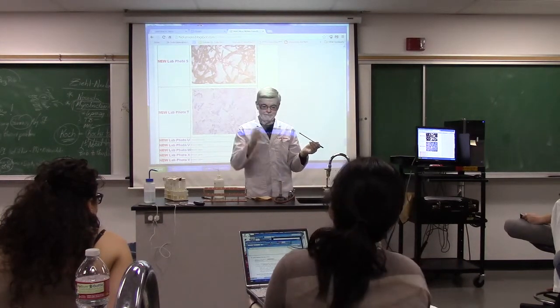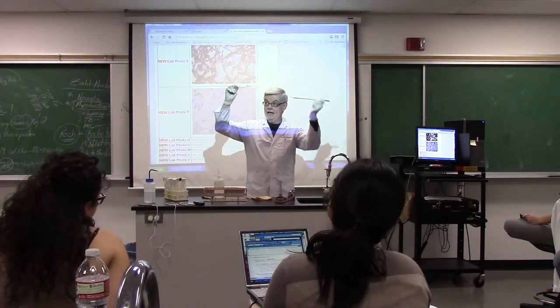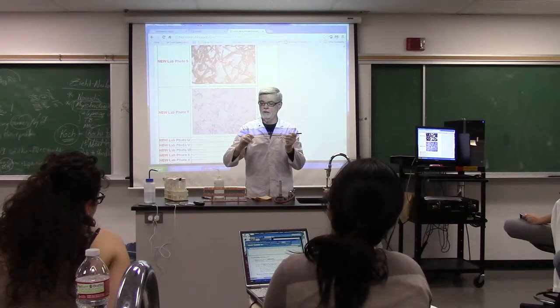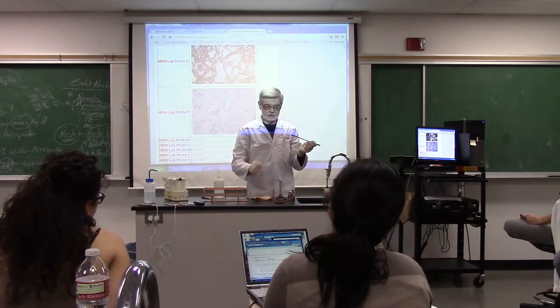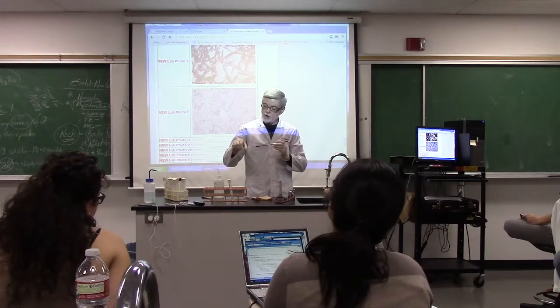Okay, you're going to flame the lip. Remember, hold it by this. Grab it with your little finger. Go downhill. Okay, now notice this is uphill. You're always going to go past half. Don't pick up at the beginning of the tube, a little bit past half. And remember, when you're stroking this like someone's hair, this is going to be kind of scabby, so it's going to be kind of hard. Don't grab the agar. And then when you put it in the water, it's going to come off in clumps, so you're basically going to have to bang it. Just bang those clumps till they fall apart.